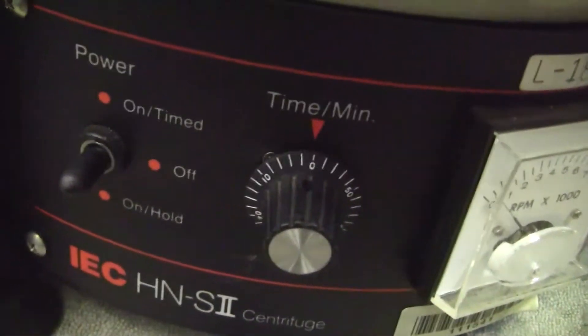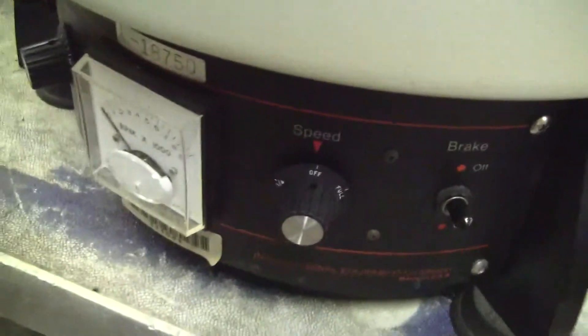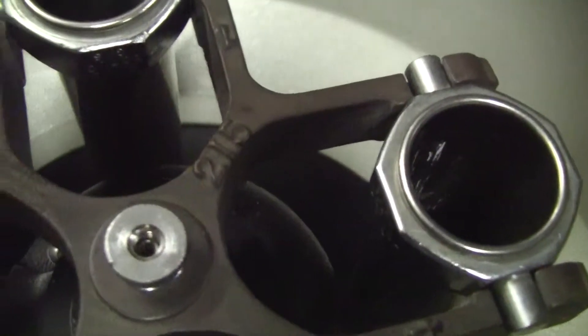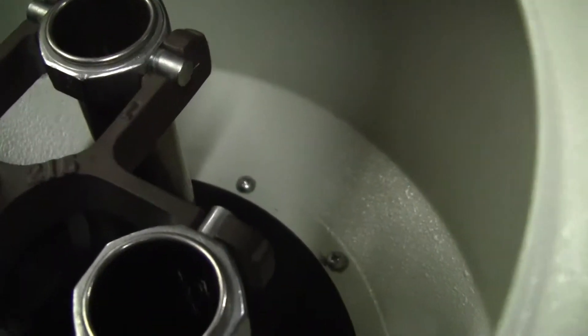You can hit timer or put it on hold. It has a brake — a mechanical brake. It has an IEC centrifuge number 215. It comes with the tubes.